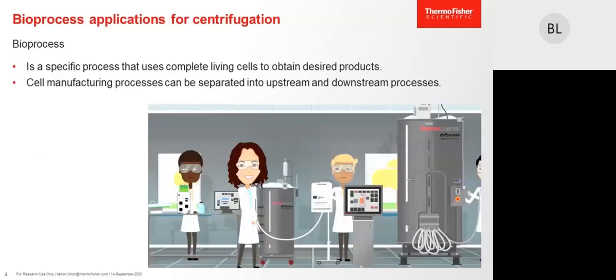Once they get to the desired size and expansion volume, the cells are producing the therapeutic, the biological products.